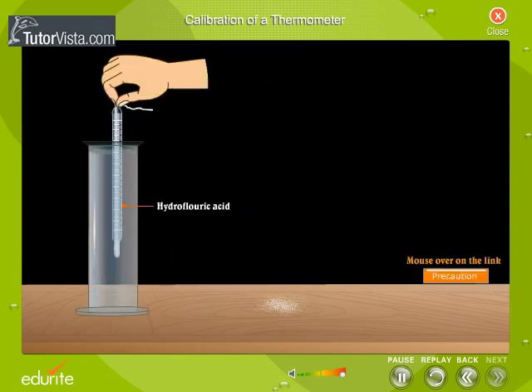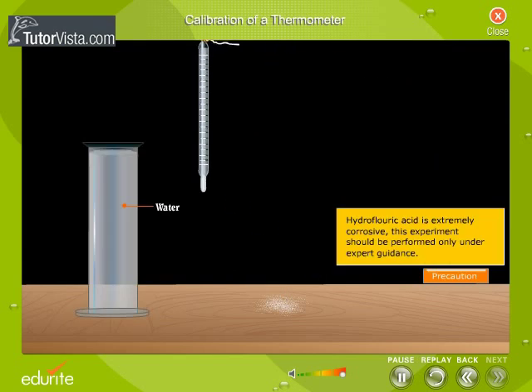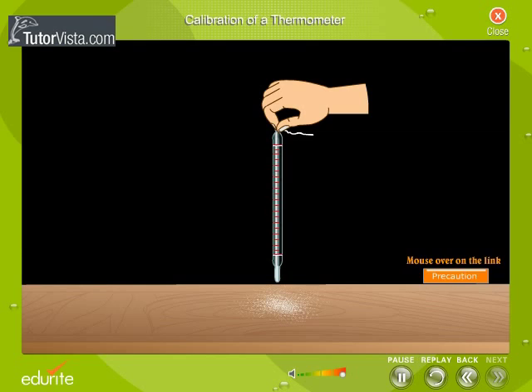The thermometer is dipped in hydrofluoric acid for a few minutes. The acid reacts with the exposed glass surface. However, the part of the thermometer which is wax-coated remains unaffected. The thermometer is removed from the acid and then washed with water. The wax is now scrubbed off. The etchings are then filled with paint for clarity. This calibrated thermometer is ready for use.